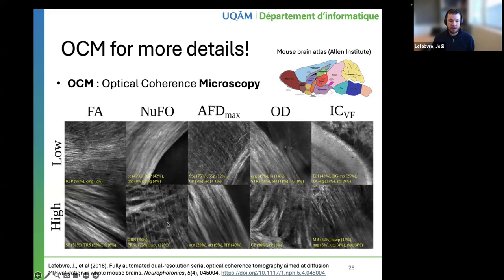And also with OCT, all the black spots here correspond to fibers going in plane and out of plane. So we saw a good correlation between the structure in OCT and the MRI metrics. That basically convinced us to pursue that technique to try to do microscopy-based tractography.